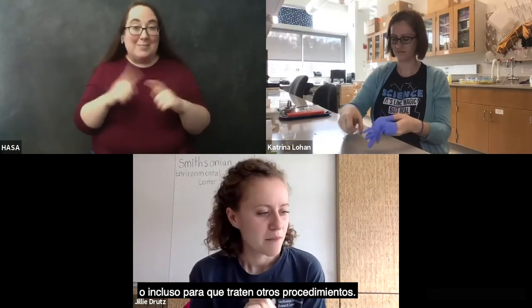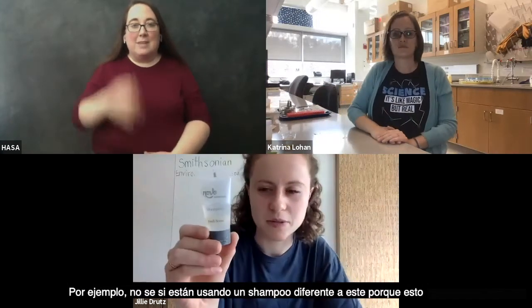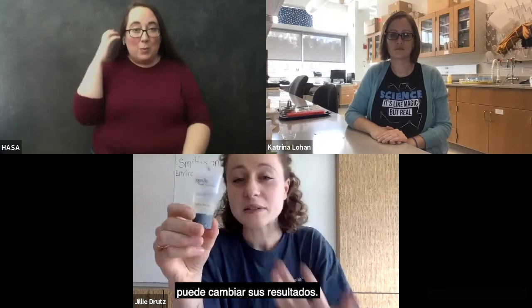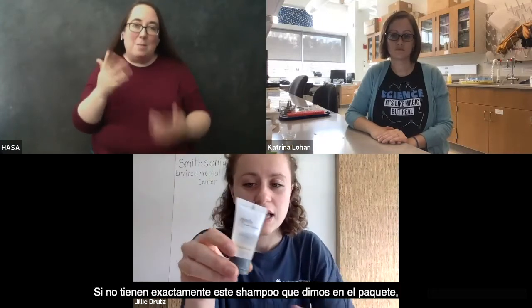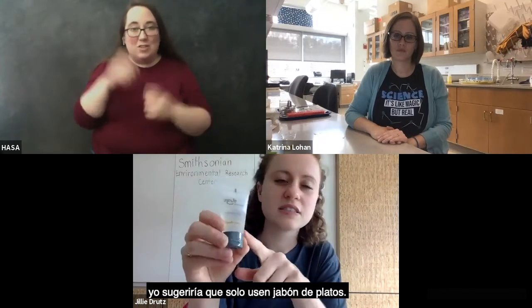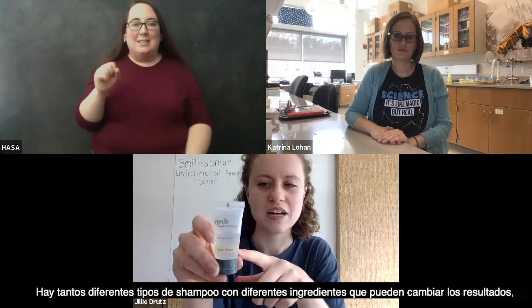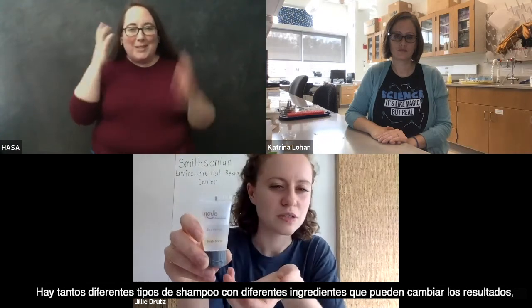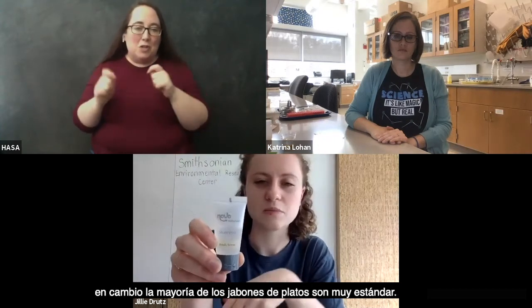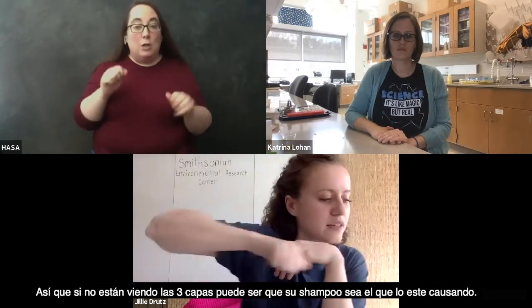Okay, and that also reminds me, if at home you're using a different type of shampoo than this, that might also change your results. If you don't have this exact shampoo that we have in the kits, I would suggest using dish soap. There are so many different types of shampoos with different ingredients that might change the results, but most dish soaps are pretty standard. So that also might be the case if you're not seeing the 3 layers.